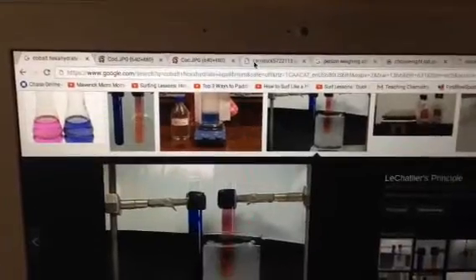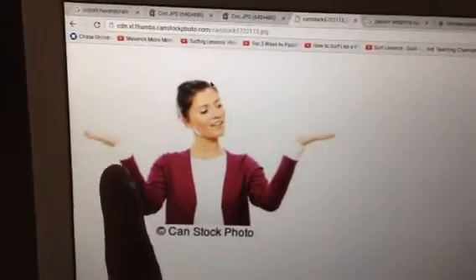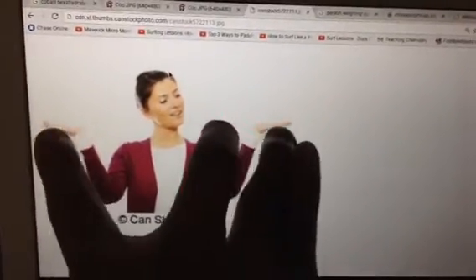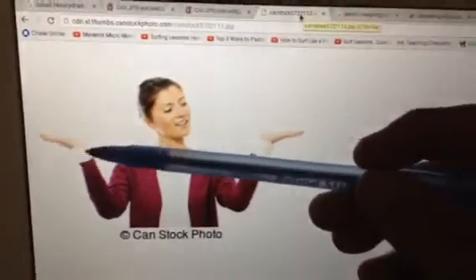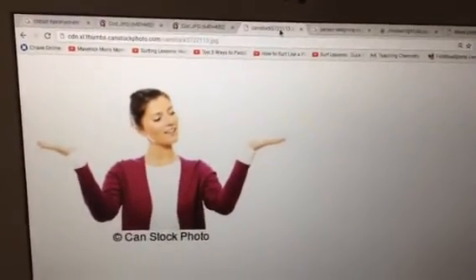So right now, remember if I go to my computer, if you guys remember, let's see if this kind of works. Remember this right here? Her hand right now represents the reactants. They also represent the products. They're at equilibrium right now. But if I add heat, which was on the left side, her left hand, okay? And the question is asking, what if I add heat? What if I put the tube into the hot water?